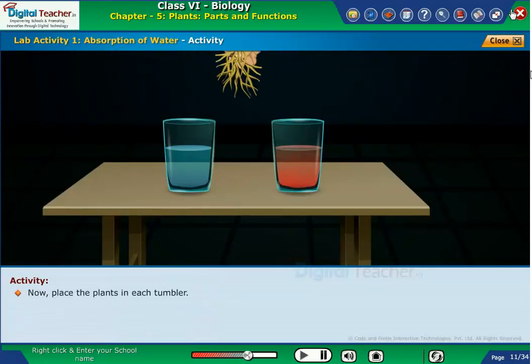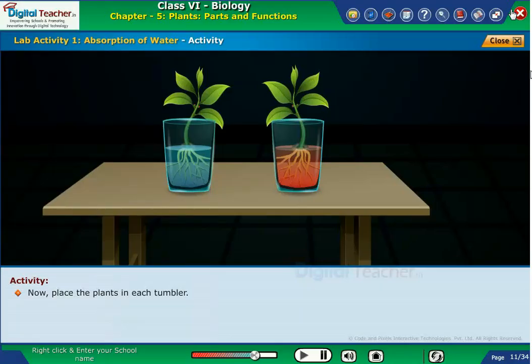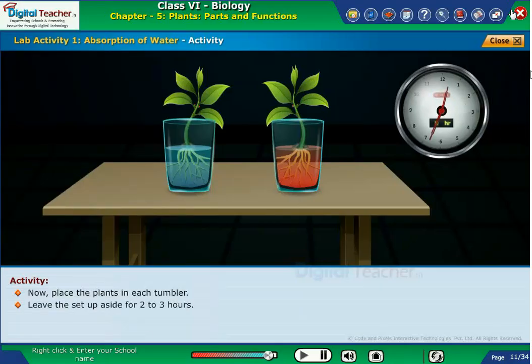Now, place the plants in each tumbler. Leave the setup aside for two to three hours. Observe the changes in the plants after three hours.